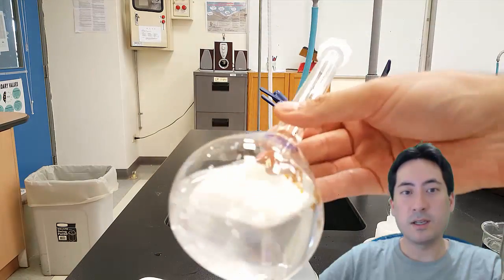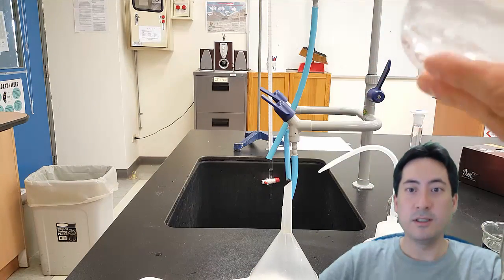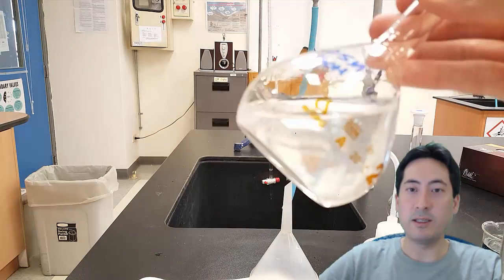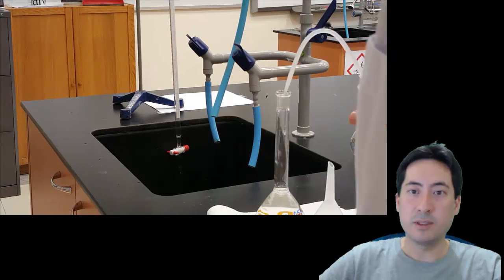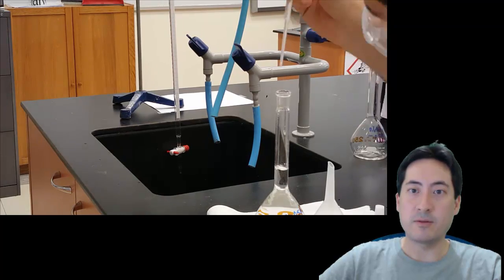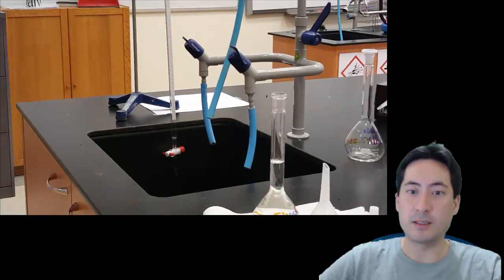So once the sodium hydroxide has fully dissolved in the water, you can then put it back on the bench and at eye level, make it up to the mark with enough water. And so then you've added enough water, then you can make sure it's fully mixed.